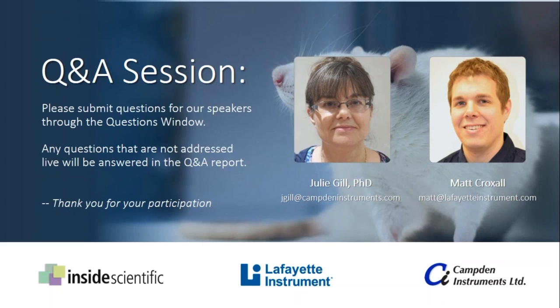Julie, question for you from Nick also at Harvard. He's asking if there's a task for compulsion, for example, like the DRL-72 test. I'm not familiar with that test off the top of my head, but for the task for compulsion, we've got the extinction task, where you train them to respond and then see if they stop responding when you no longer give them reward.